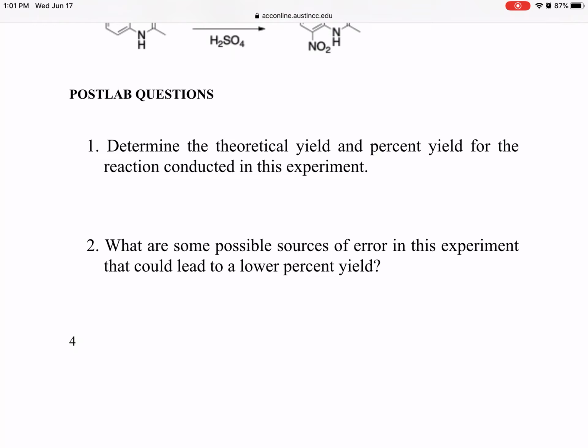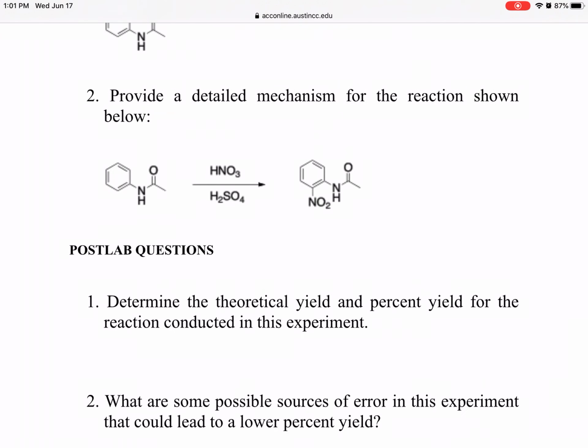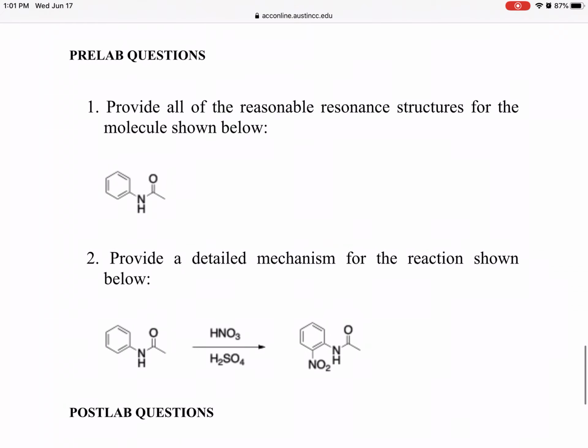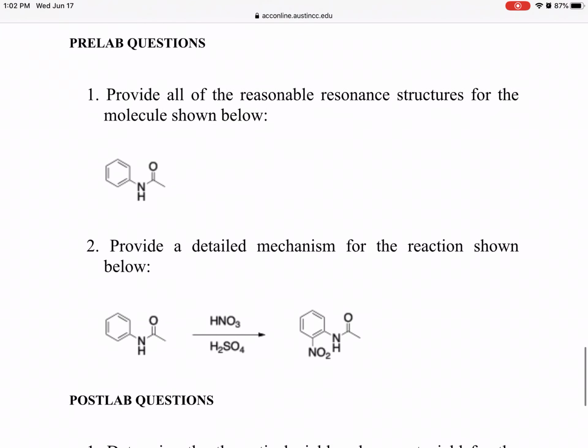So these are the pre-lab and the post-lab questions, and on top of this you also have to write a discussion, remember? This discussion is going to be some of the theory that is already written in the background information, so you can put them together and come up with a nice discussion. You can also use the same thing but do it in your own words, so then I know that you read it and you understand it. Now we are putting it into your own words. Okay, understanding, you are doing it for yourself, not to make me happy, but I will be happy when you have a good lab report.